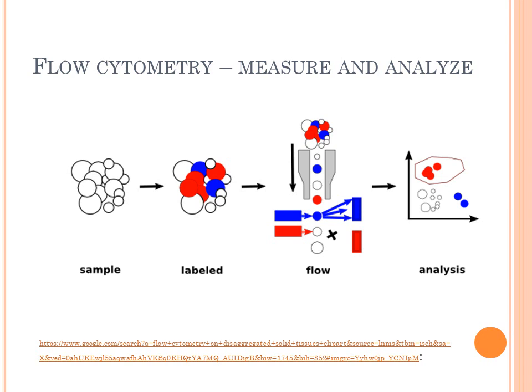We will also be assessing the forward light scatter, what light comes through here, and also the light that comes through from the side, and ending up with what's called a dot plot. It's a graph, and the interpretation in the graph involves recognizing the different areas. These are going to show up as dots on your actual graph, but here they're nicely color coded, showing you that each one of the red labeled cells in our example are going to show up in this part of the graph. Our blue labeled cells are going to show up on this part of the graph.